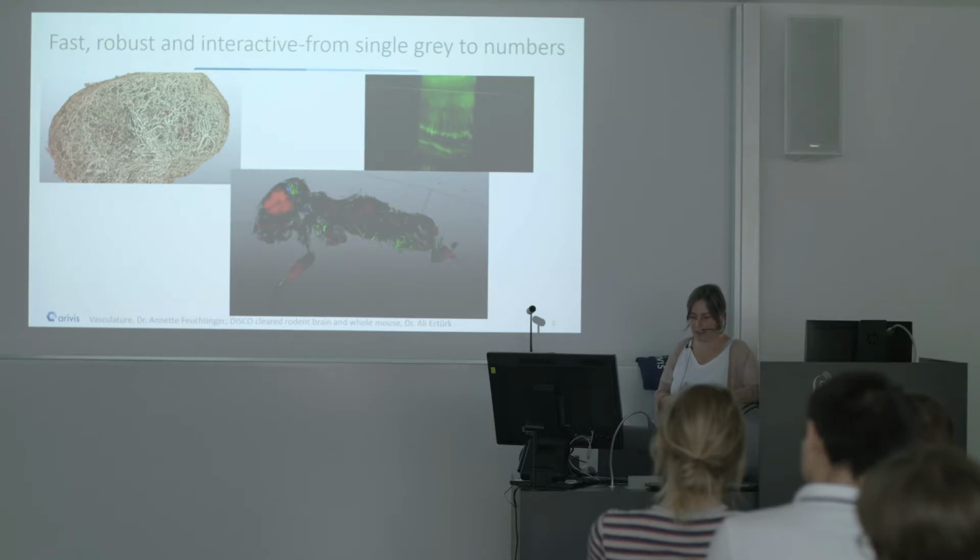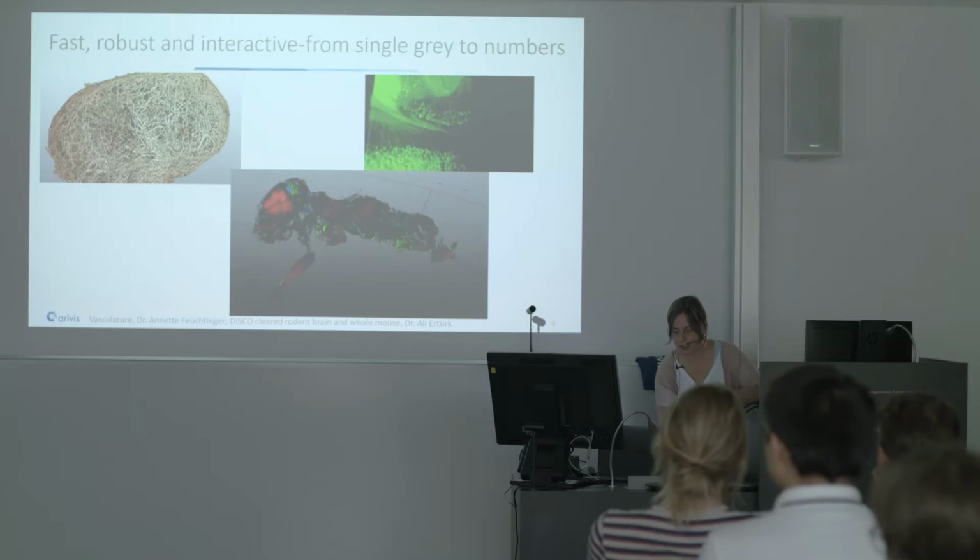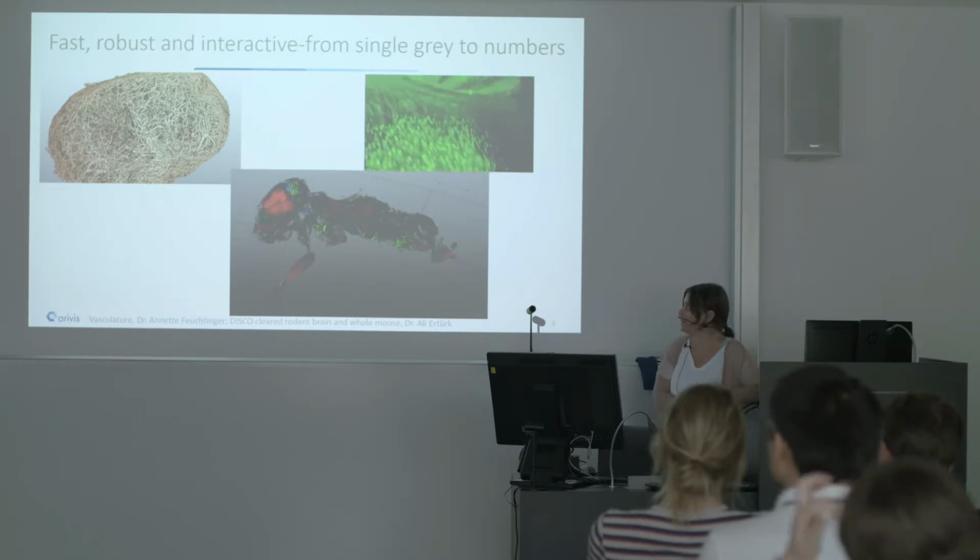Basically, sometimes you would apply filters for nicer visualization, which my customer did here on the left-hand side.